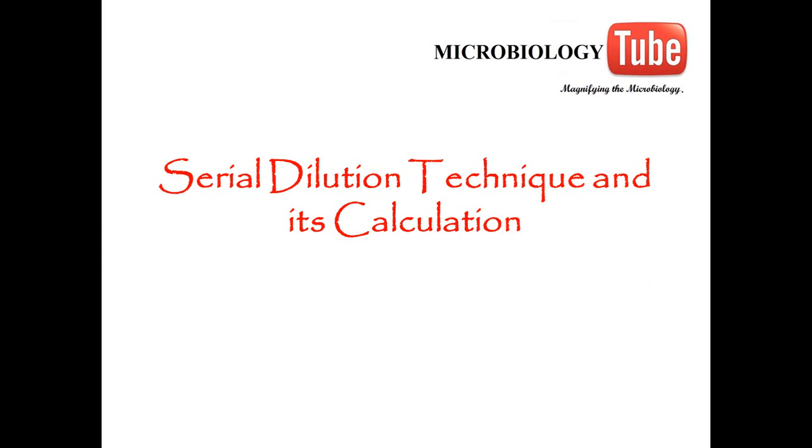So today we'll be talking about the serial dilution technique and its calculation. Many of the students are confused about the calculations of the serial dilution. So here I am going to make you clear about the serial dilutions and its calculations.